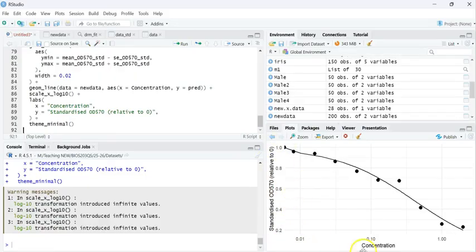Remember, you'll have to change the axis labels, but through those concentrations with a log 10 scale, we've produced a nice line through our data. So remember, for the viability part of this assessment, you need a nice figure based on your data set. And then you also need the IC50 calculation as well, based on your data set.